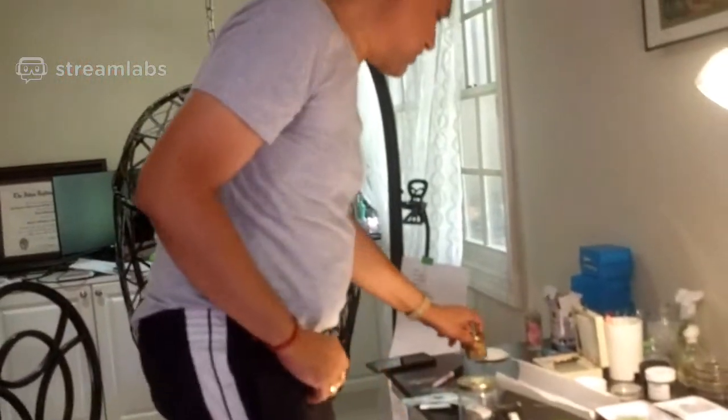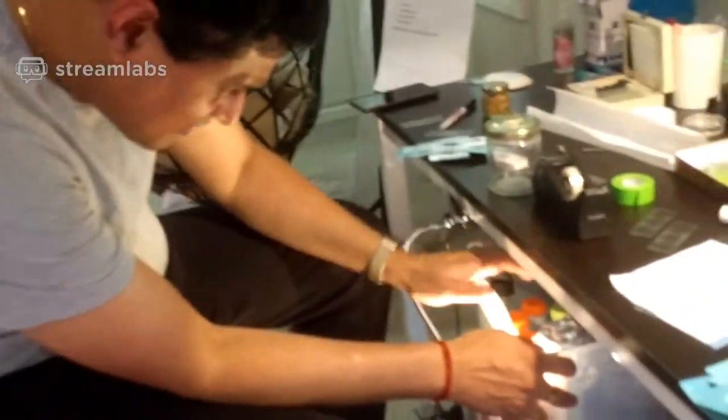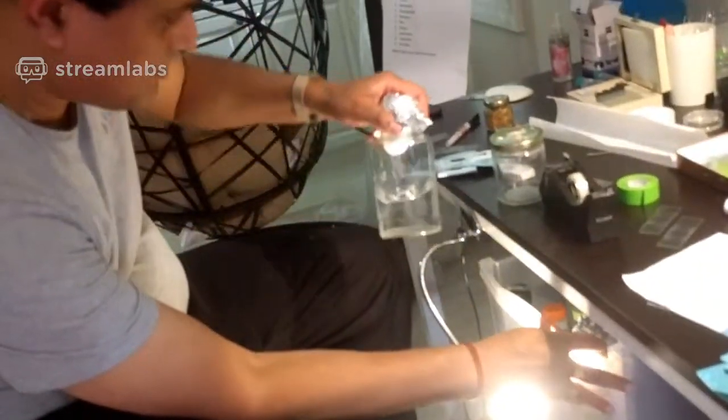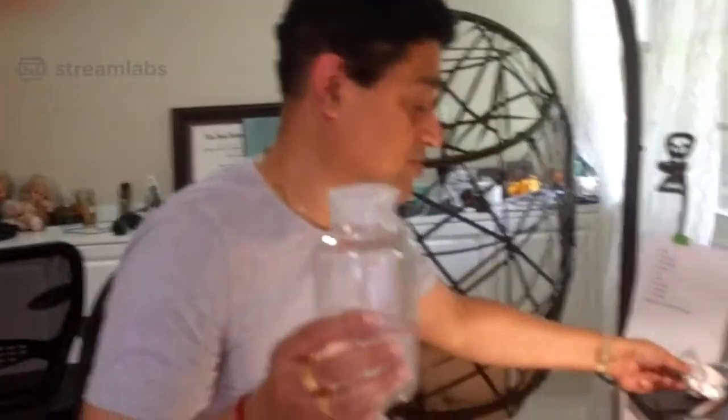Extraordinarily useful things. Take some wheat, put it in a bottle like this. All you have to do is, there you go. I have some water here. I put this in this pressure cooker, so it's supposedly sterile, free from organisms, because things tend to grow very rapidly if you just let them be.